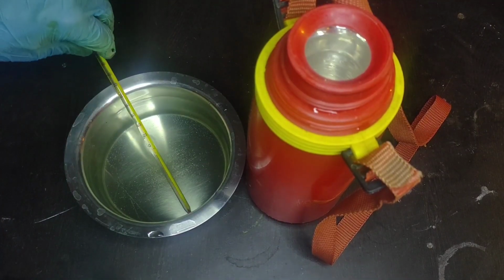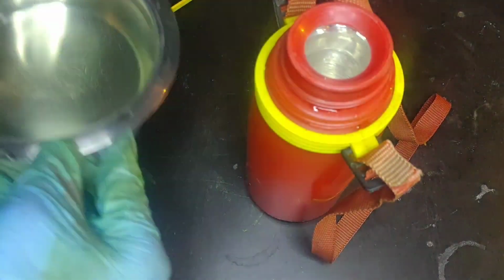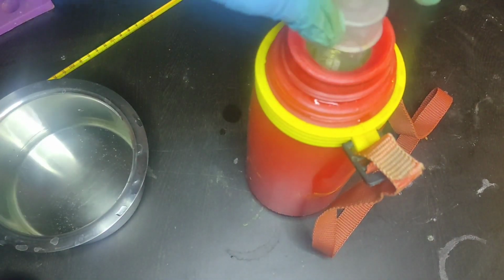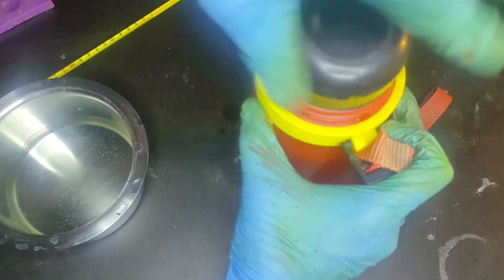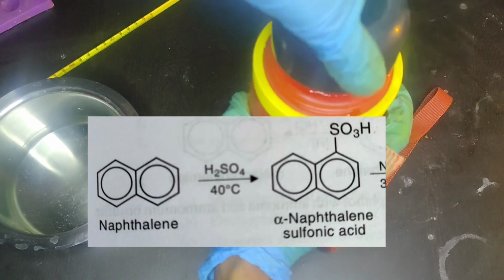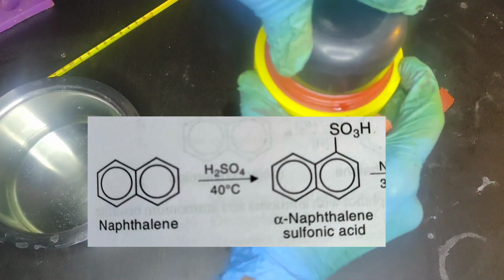Now I am pouring some warm water, whose temperature is around 45 degrees Celsius, in a thermos flask. And now, after filling water, I will place the boiling tube inside it and place the cap. On reaction of sulfuric acid with naphthalene at 40 degrees Celsius, naphthalene 1-sulphonic acid is formed.